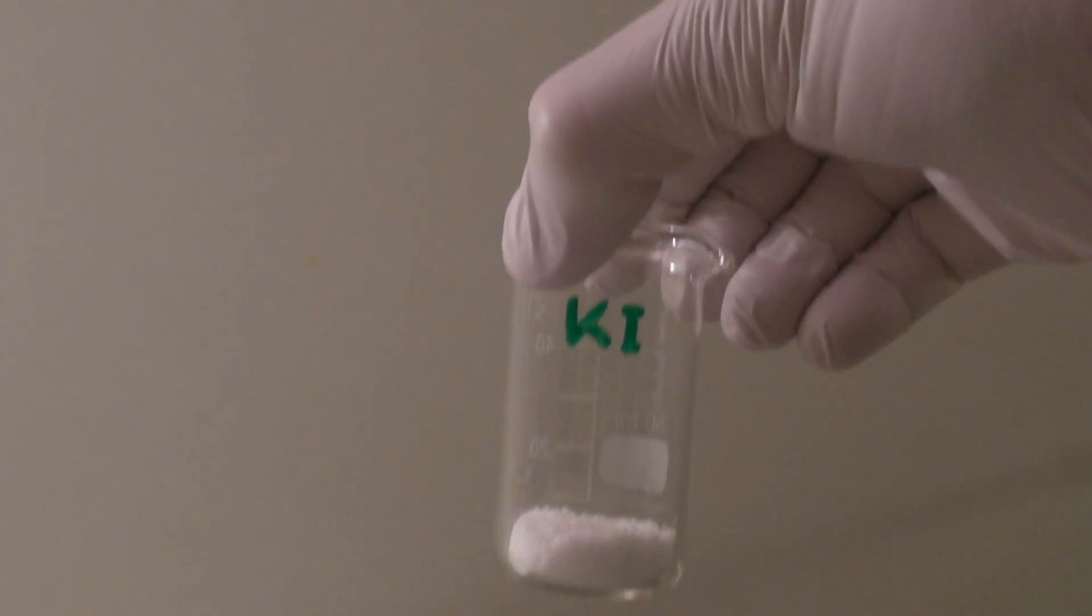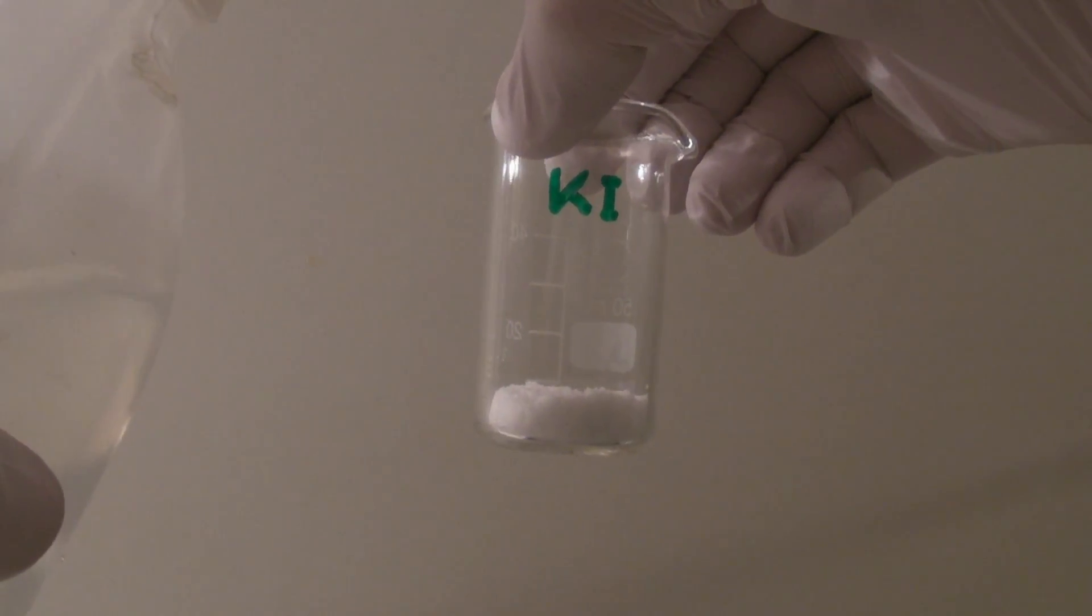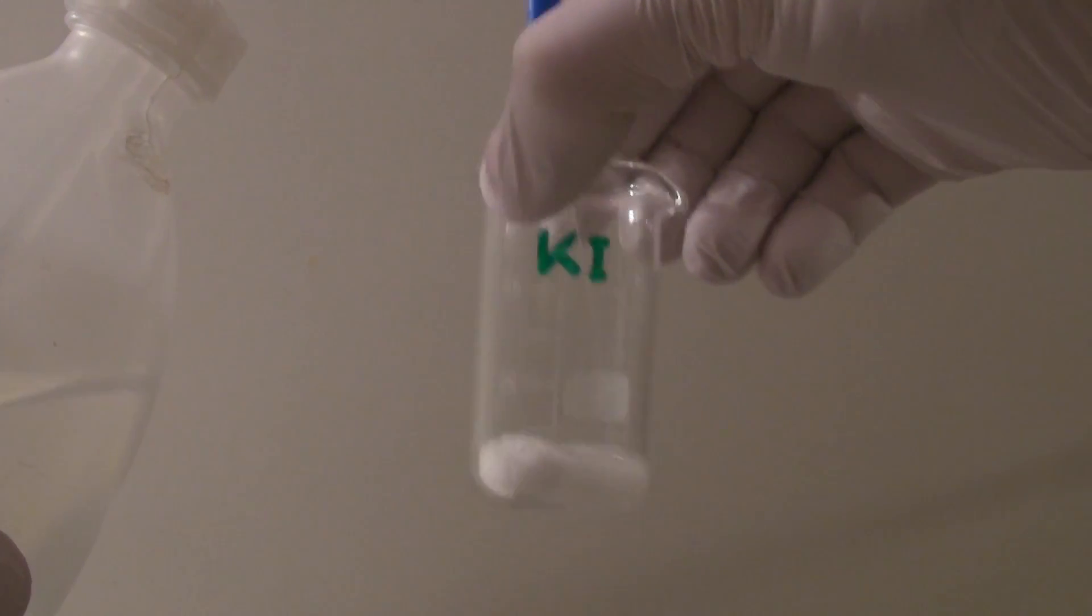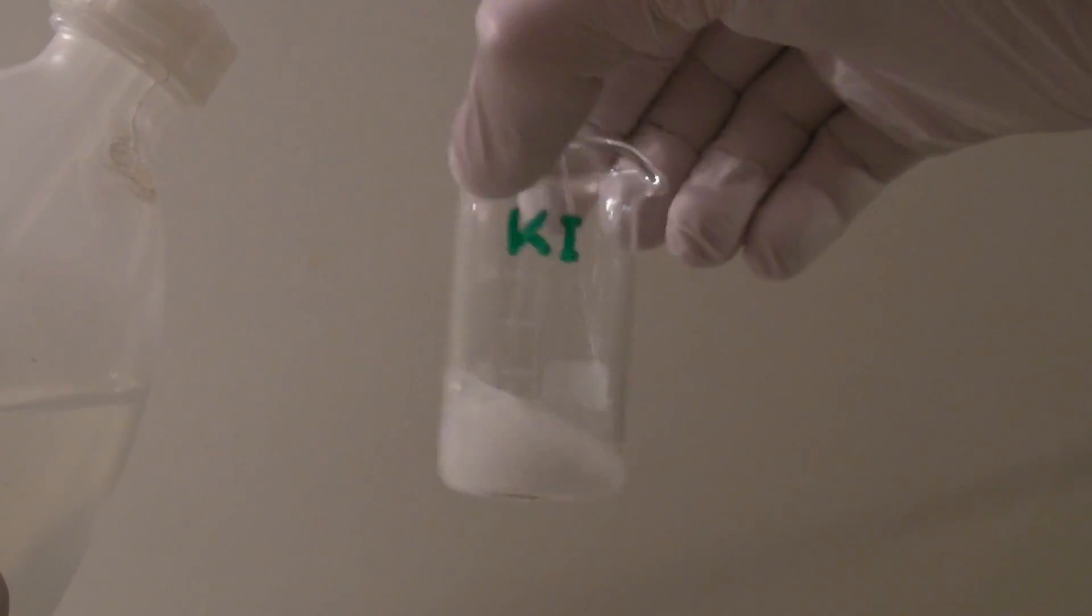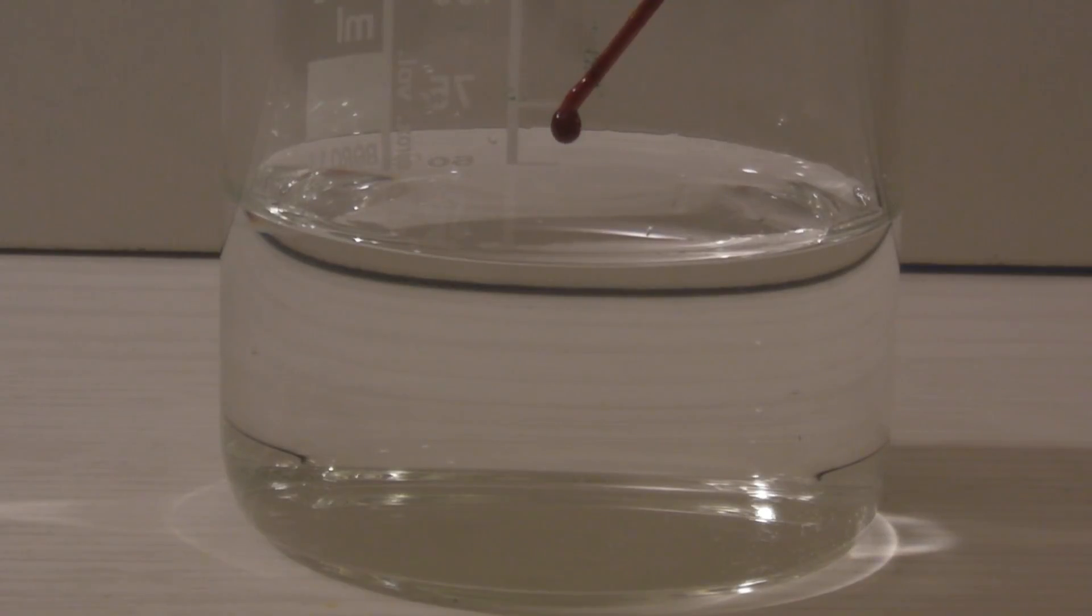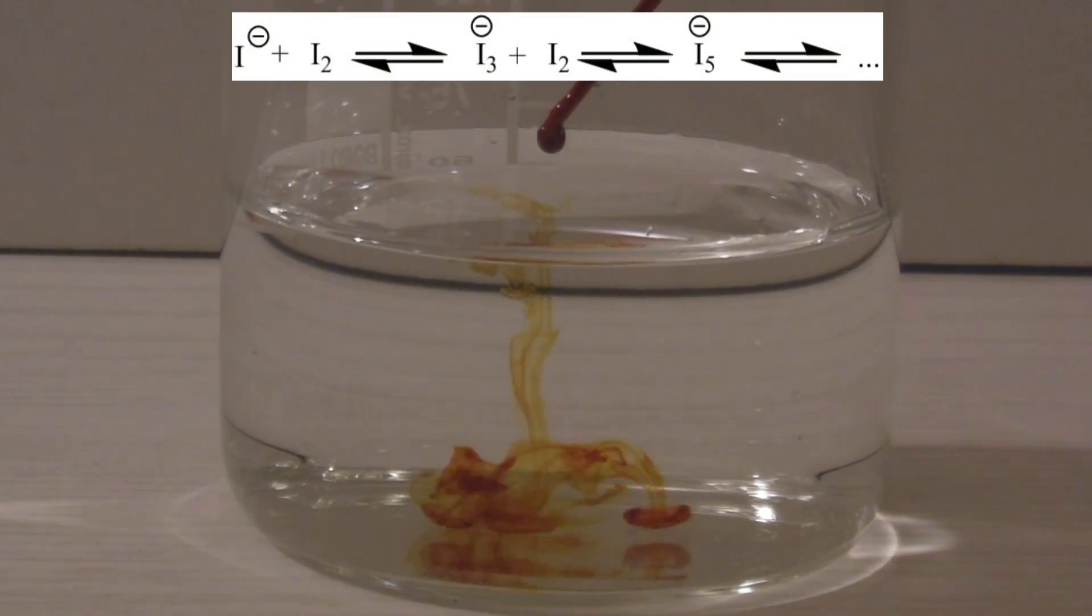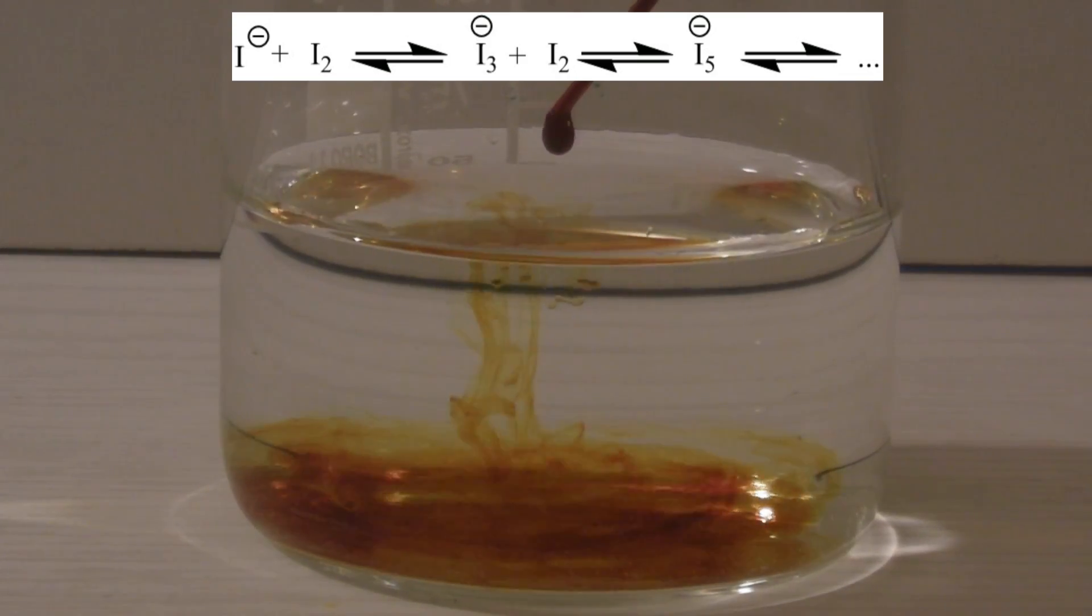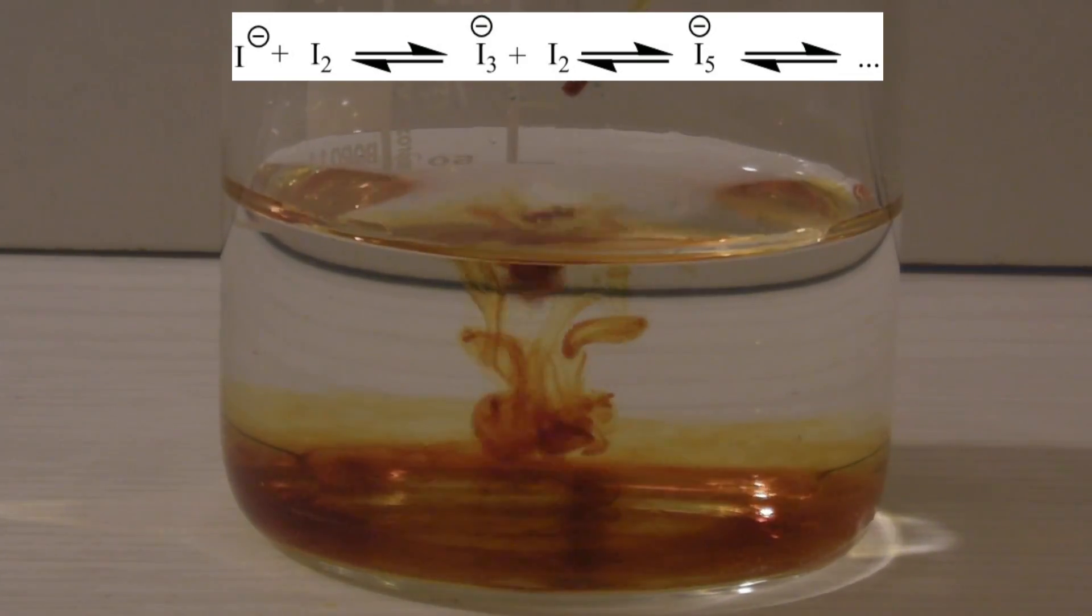In inorganic chemistry, elemental iodine usually forms the iodide anion in simple reactions, of which the alkali and earth alkali metal salts are colorless. Colored anions which do not contain other elements are only polyiodide ions that contribute to the color of a Lugol solution.